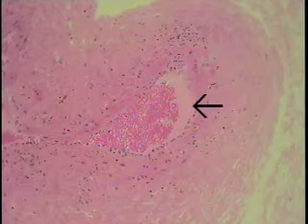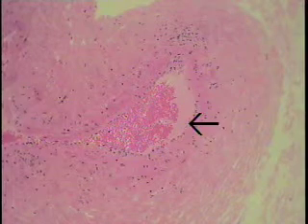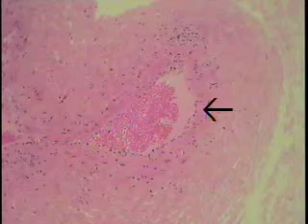Now let us examine a large vein, the jugular vein, which is shown at the arrow, at a slight increase in magnification. This is the medium-powered objective of the internal jugular vein in that common carotid sheath we were examining earlier with the scanning objective. One can make out the tunica intima right at the tip of the arrow, primarily the endothelial cell lining. This darker staining is all that the tunica media amounts to.